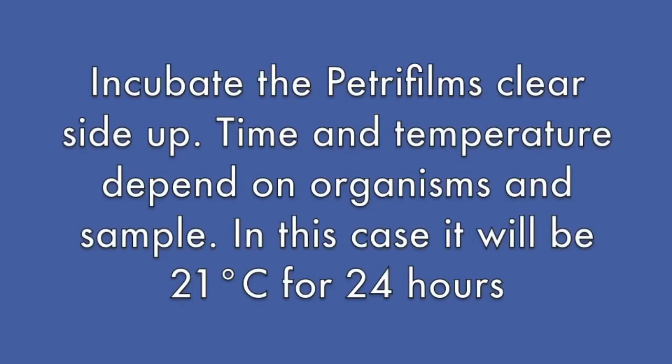Place the petri film clear side up in an incubator at the appropriate temperature for the proper duration. In this case, we incubate at 21 degrees Celsius for 24 hours.